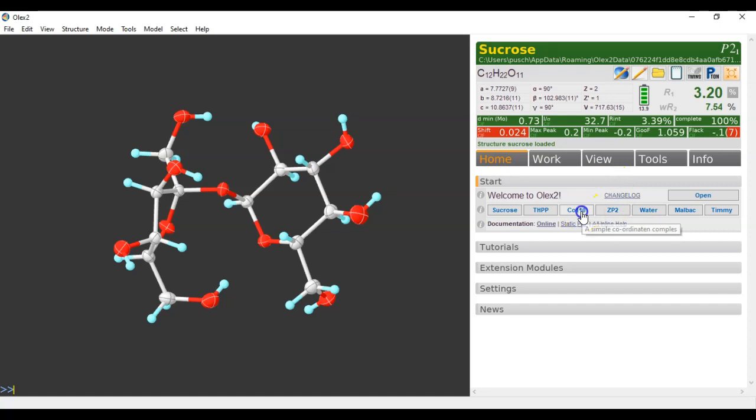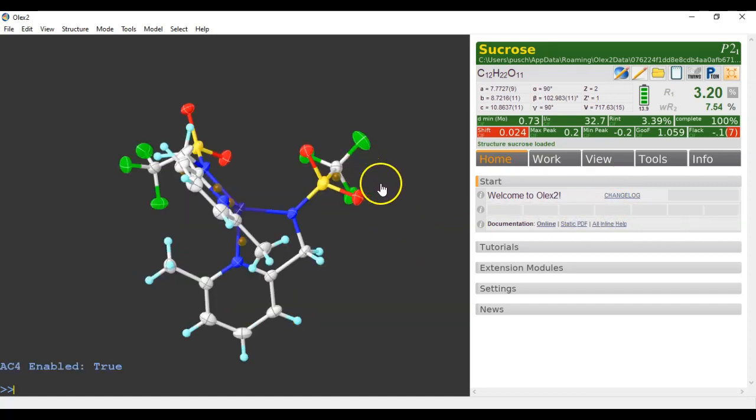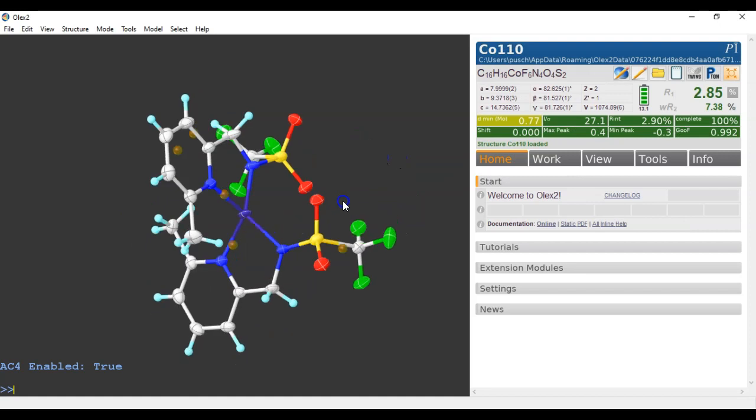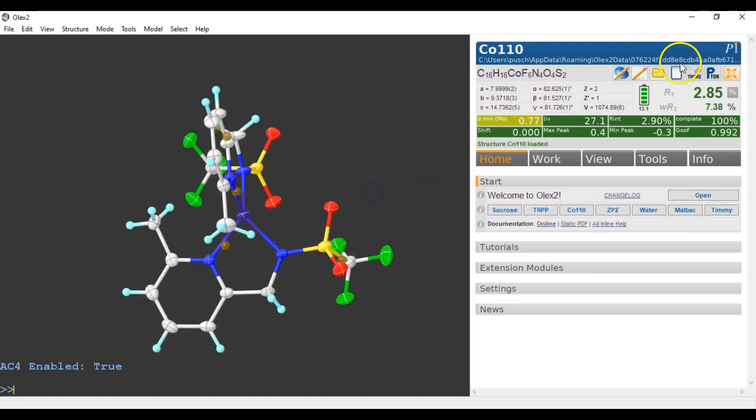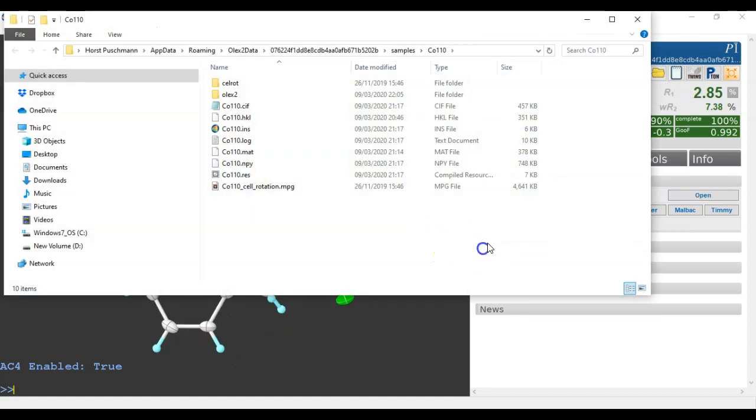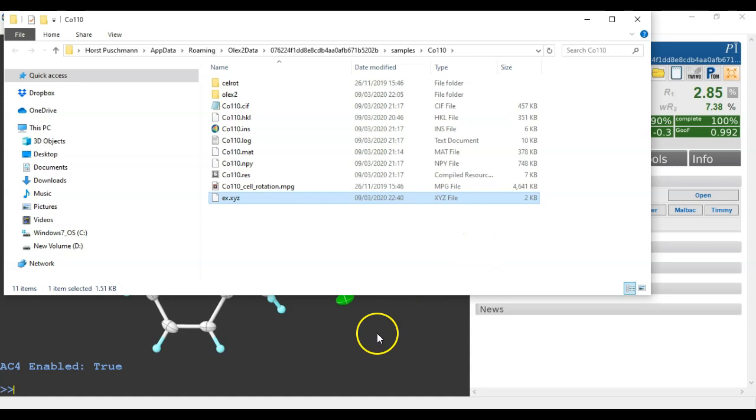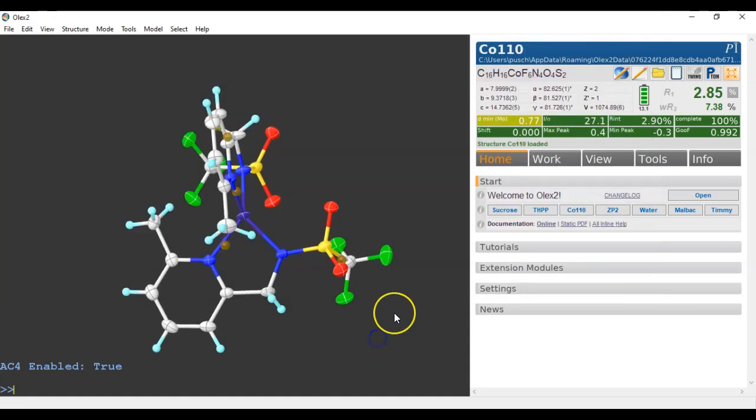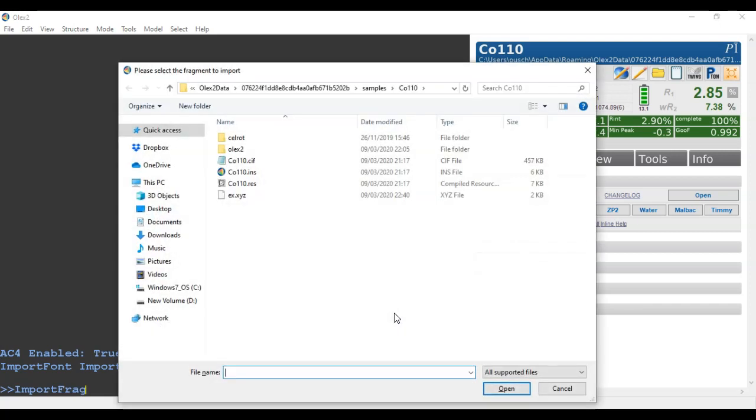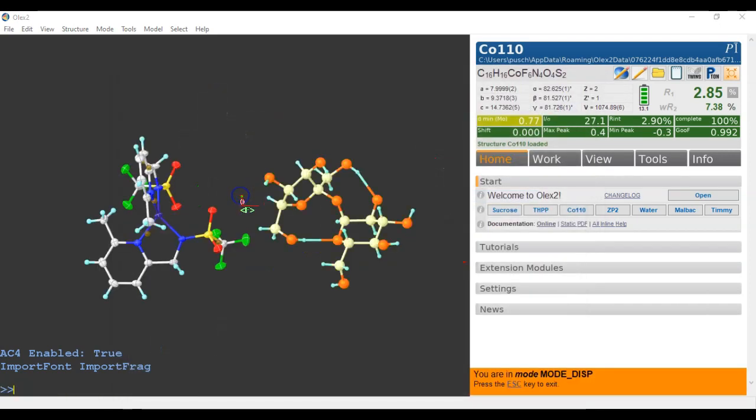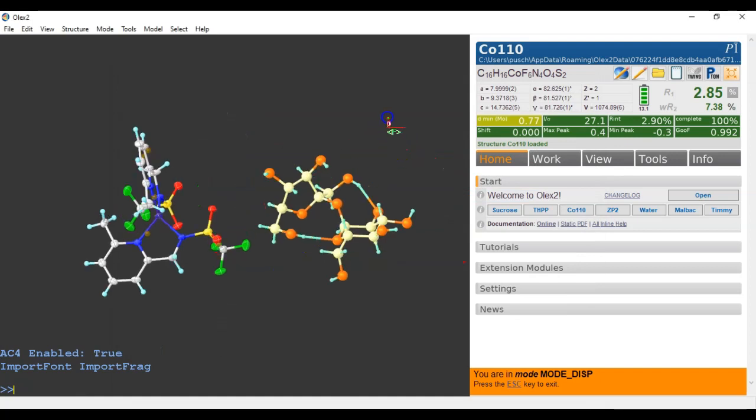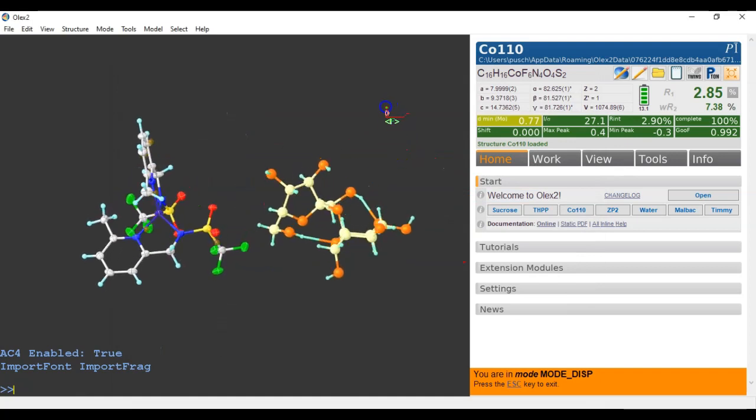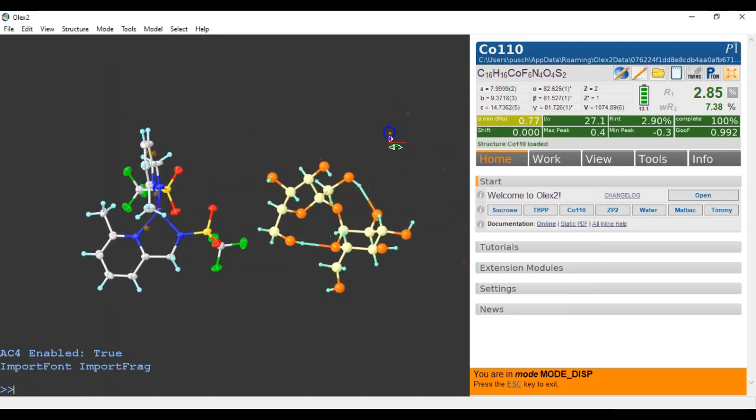One day I'll get this right. There we go. C0110. And I can now paste this file in here and go import frag. And I can now import this example file from before into this structure. So it's a completely different space group.